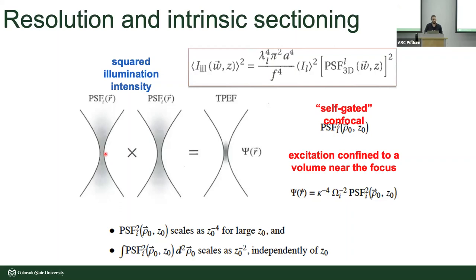Well, if you bring to me clear, roughly transparent cells on a slide, we don't need to image deep, often confocal will be better. And the reason for that is because you'll get better spatial resolution. You don't need the longer wavelength excitation to get deep within the tissue. So it's important to note where confocal actually does beat two photon. And generally that's just in the spatial resolution.